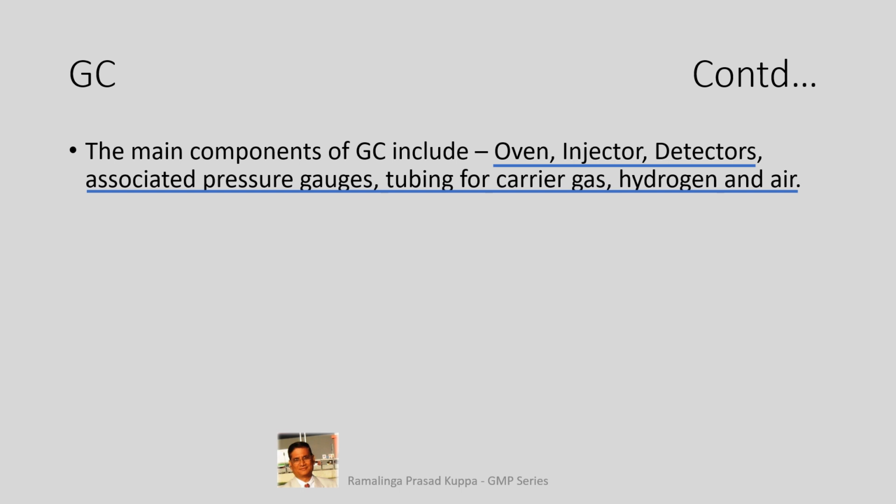The inlet tubing should be fitted with silica gel tubes to make the gases free from moisture. The silica gel should be coarse, self-indicating crystals. Even aluminum oxide pellets or molecular sieves may also be used, but they are not self-indicative. You may have to regenerate after some time to make it active again. All these aspects also should be part of your qualification report. The type of injector depends on the requirement. Manual injectors may be cumbersome and time-taking for a series of injections.